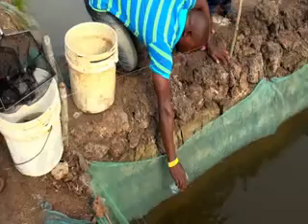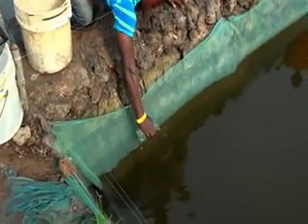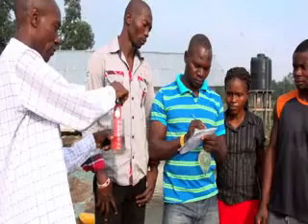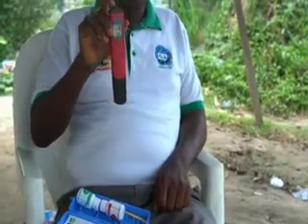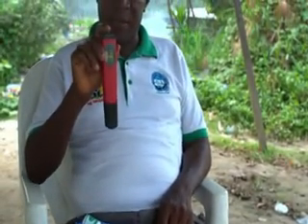The pH meter is used to test the pH — that is the alkalinity and acidity of the water. What we have here is the pen type pH meter. It's digital; it measures the pH of the water and also the temperature of the water. Once you put it on, you have the temperature displayed below and the pH above. But this one is not calibrated yet.